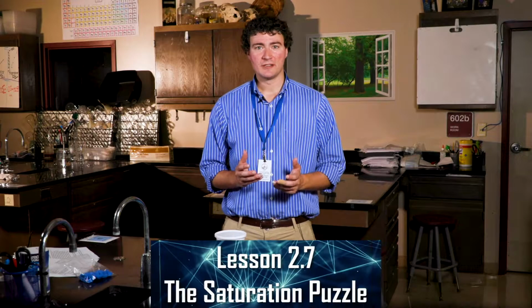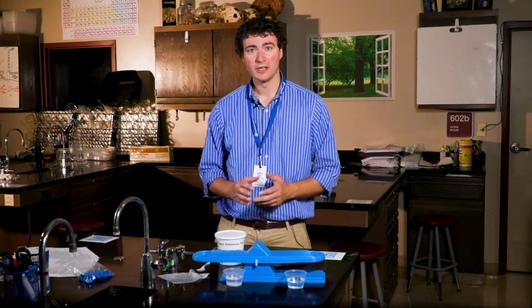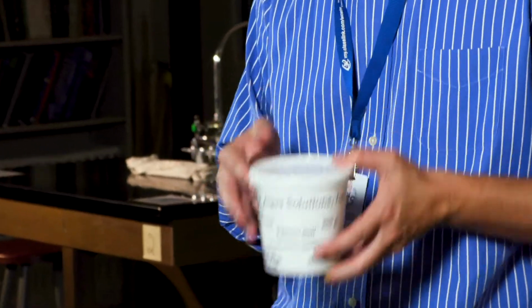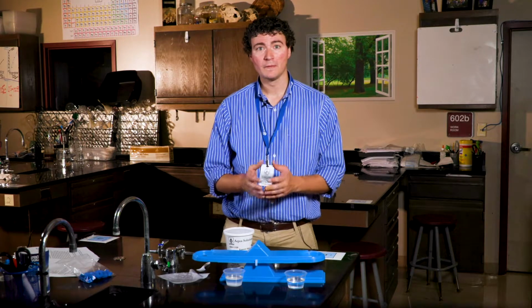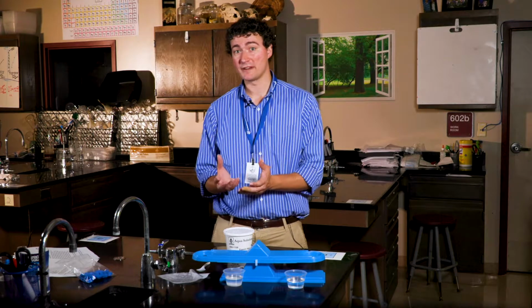Lesson 2.7 builds off of the previous lessons by having students use the techniques they have learned to identify an unknown material. To do this, students get an unrevealed material, which is really Epsom salts. They determine the mass of salt it takes to saturate 50 milliliters of water, and they compare the value to other solids, thus identifying the material.